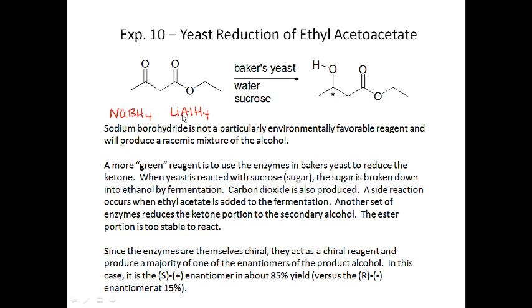But lithium aluminum hydride is a little pyrophoric on occasion. So these are not the most environmentally friendly reagents to use. And not only that, but when we do form this chiral center with a non-chiral reagent, you're just going to get a racemic mixture of that alcohol.